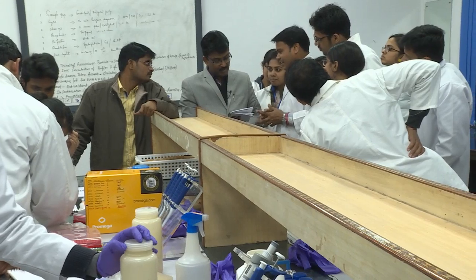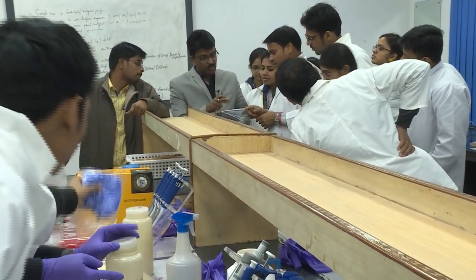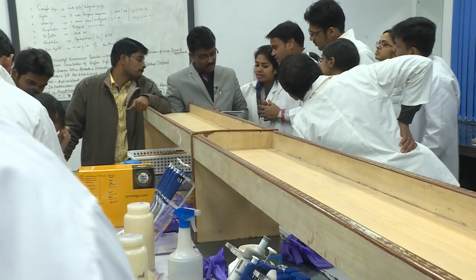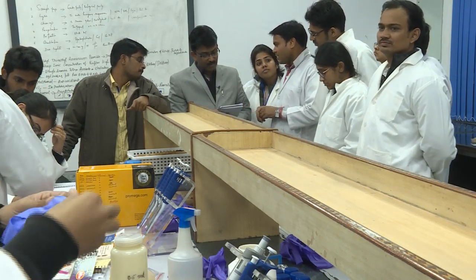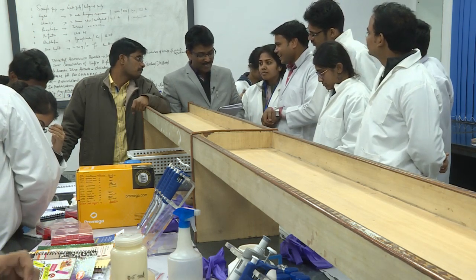Okay, fine. So, what is PS? Pseudomonas. Pseudomonas group, they had some other reading? Same. This was the reading. This is scooping, okay, fine. Scooping one, maybe sir, it is not properly suspended, otherwise quantities would be more. No, problems are different, okay.